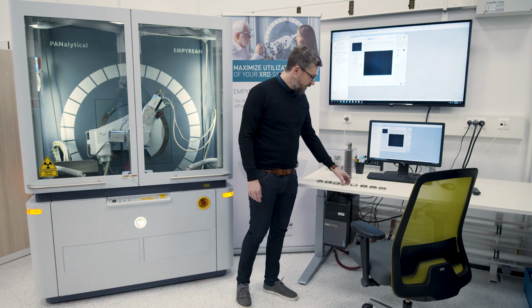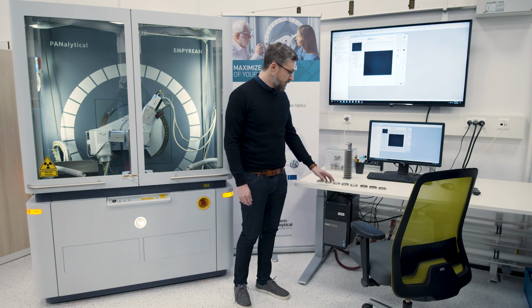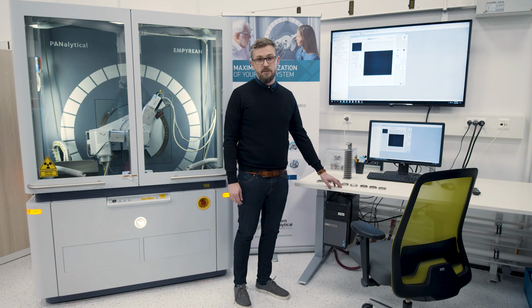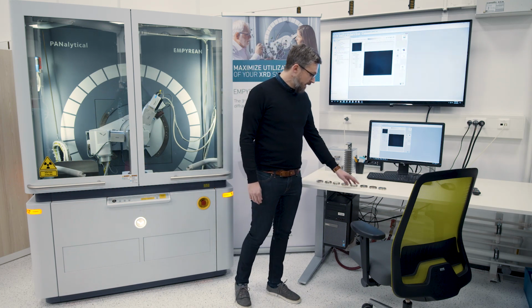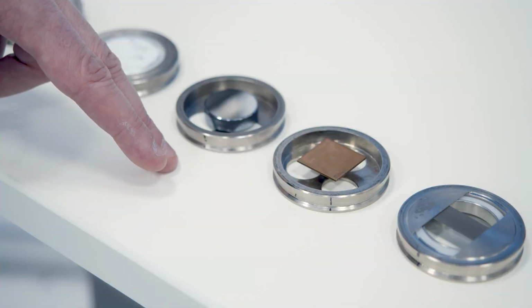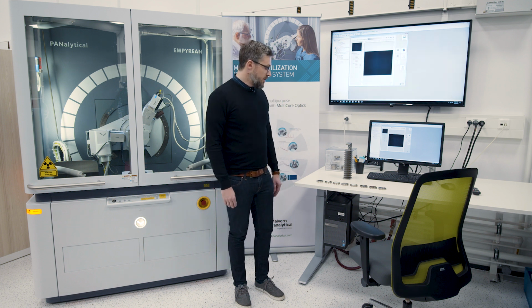Since we're then already automatically switching to transmission geometry, I would like to demonstrate small angle X-ray scattering measurements on a titanium nanopowder. After that, we will be measuring an iridium coating on which we will measure X-ray reflectivity, but also grazing incidence diffraction, just to investigate the layer in more detail.